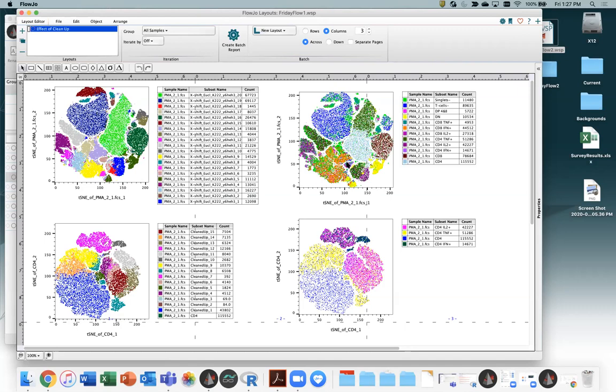Pink, double negatives for 4 and 8. And again, if we look at some of these populations and say, oh, there's some weird populations in there, I wonder what's this little node in the middle? How come the end of this might be a different cluster than the rest of that light blue one? So right here, double negatives, probably a weird kind of cell that it's going to keep factoring in. So just to say that there are some things that you'll know as an expert that you will say, well, I know I don't want to factor that in, and that can help overall your clustering results. But then if we look at the rest of it, we'll see that there's some good concordance between what we'd expect to find and what the clustering result has pumped out.